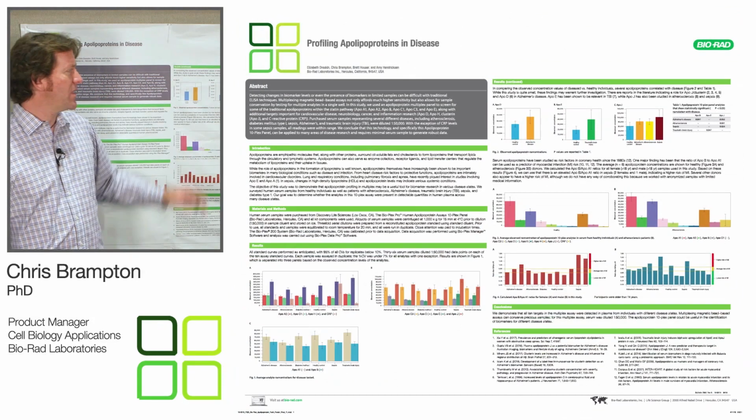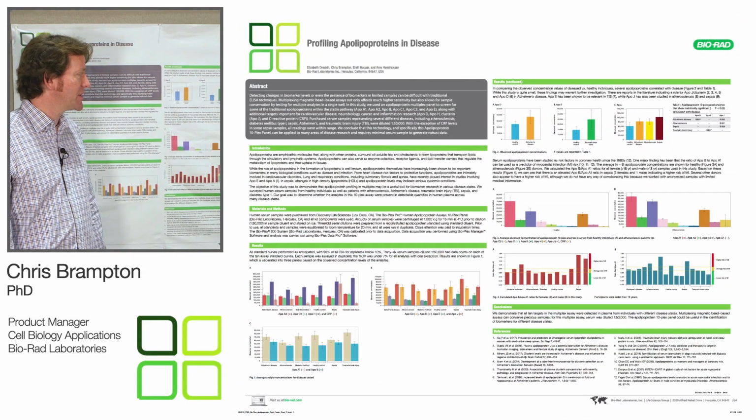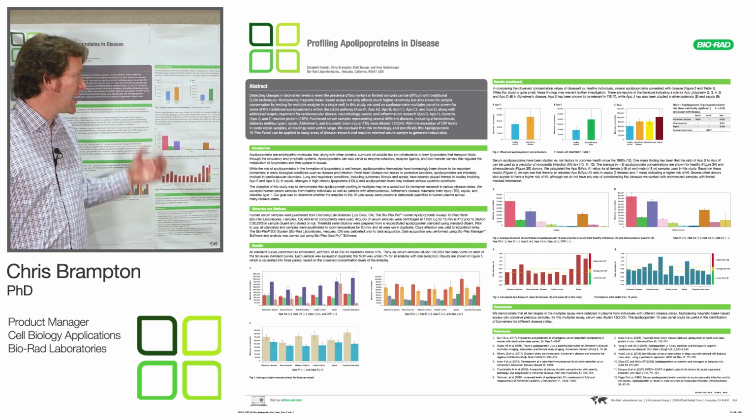So we can confirm that the levels that we're seeing changing here have actually been published in the literature, showing that our panel is working as we expect.